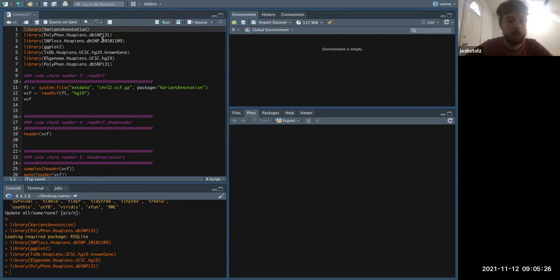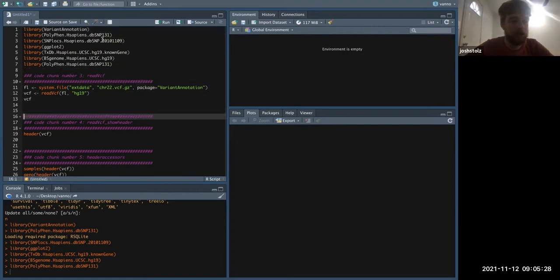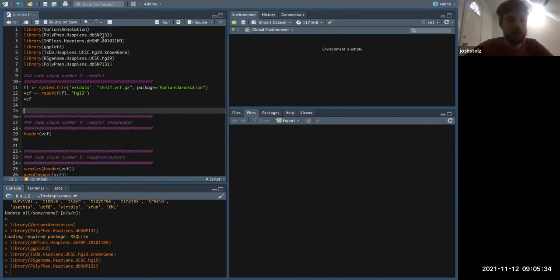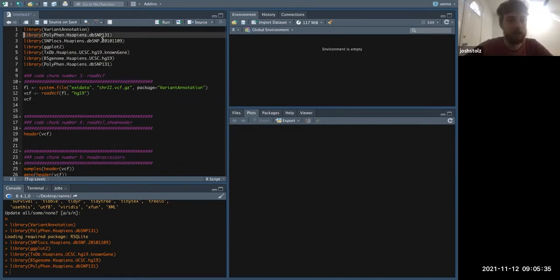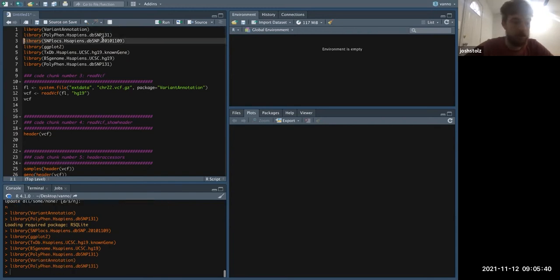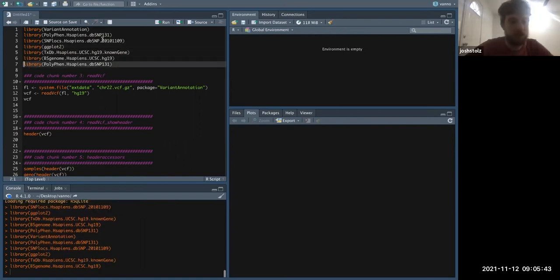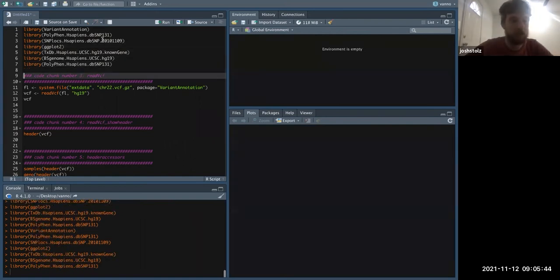The hope is — there's a lot here — but my hope is that by the end of this, we can read a VCF into R in an efficient manner. So here are the packages we need. If anybody needs time to download those, let me know.